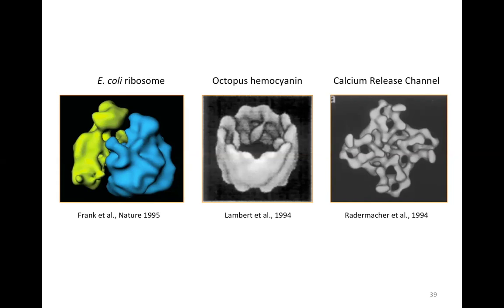At that time, the realization was, well, we can obviously improve resolution, but we didn't have any hope to get anywhere near atomic resolution with this technique. But as it was, it gave us information about the changes in conformation, a much more realistic view of molecules than the ones that were confined in crystals, as in X-ray crystallography.